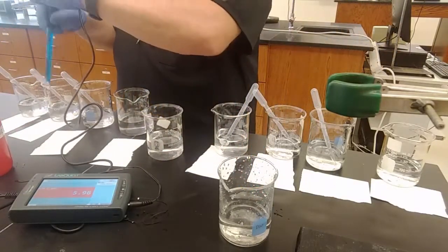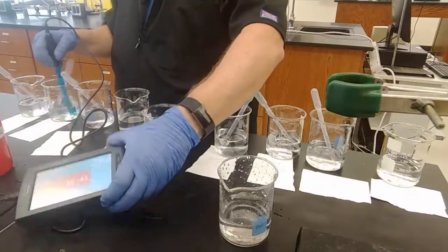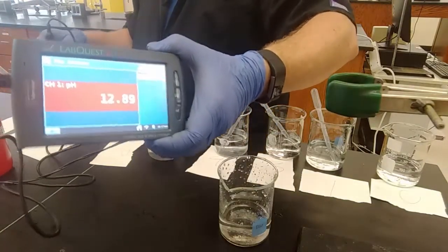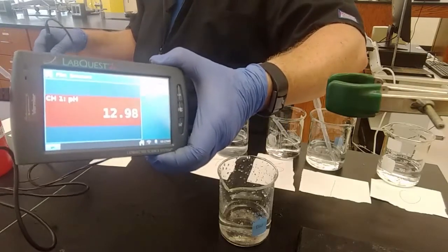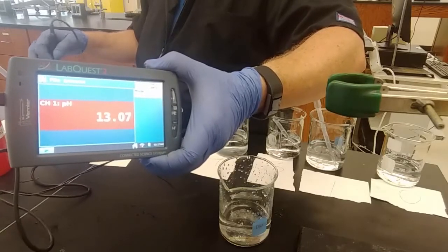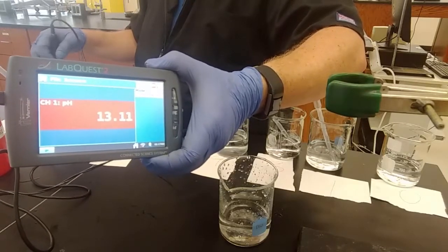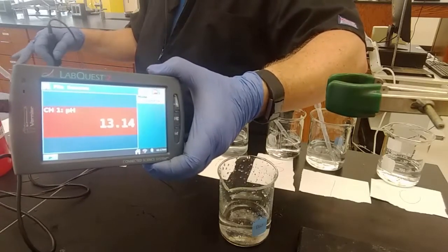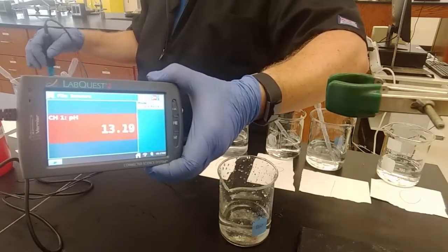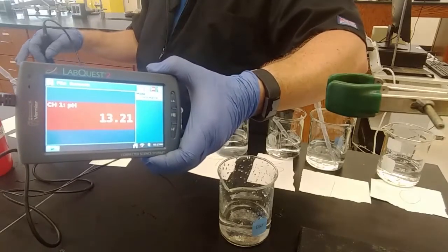Expecting a 13. Looky there. That not deionized water had some acid in it, but not enough to counteract the extreme basicity here. What's interesting is that it's above 13. You watched me. I measured it really carefully.